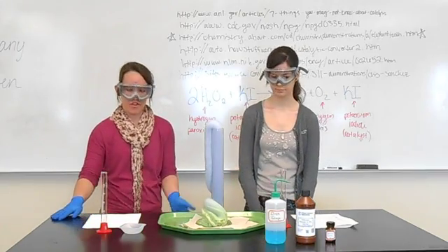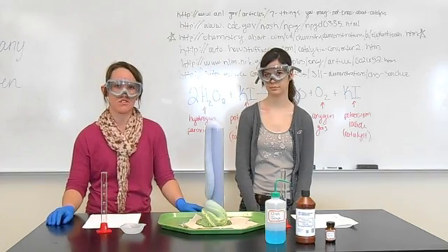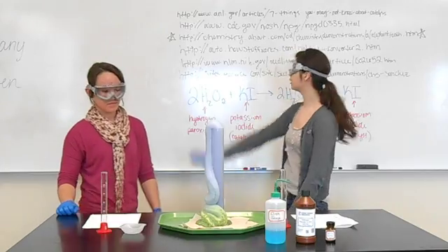You can see that a chemical reaction has taken place as evidenced by the gas that's being released and also by the temperature change. Our original experiment was found at chemistry.about.com, and that is the end of our experiment and the rest of our references.